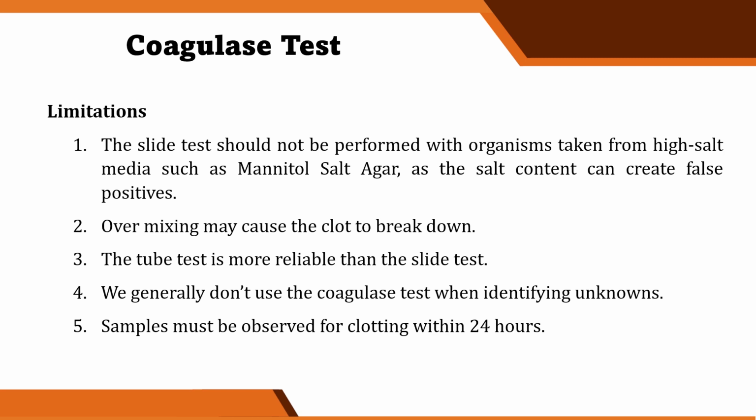Okay, so this is because some strains that produce coagulase also produce an enzyme called fibrinolysin, yung sinabi ko kanina, which can dissolve the clot. So therefore, the absence of a clot after 24 hours is no guarantee that a clot never formed. Okay? So the formation of a clot by 12 hours and the subsequent disappearance of the clot by 24 hours could produce a so-called false negative if the test were only observed at that 24-hour time.